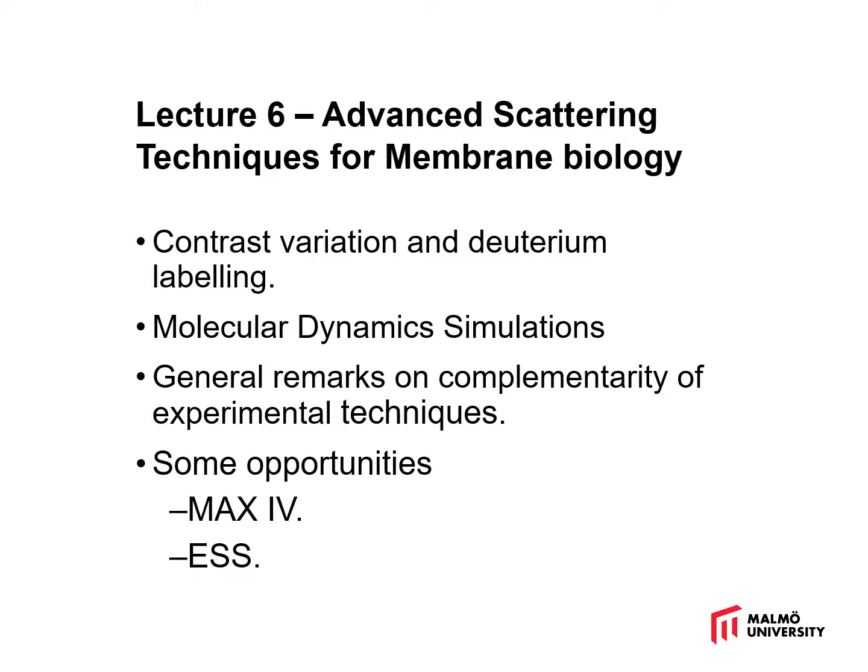In this final lecture, I'm going to talk about techniques which allow small angle scattering to gain information that no other technique can, particularly with application to membrane biology. I will introduce the concept of contrast variation and deuterium labeling. I will talk about molecular dynamics simulations and the complementarity between the two perspectives.